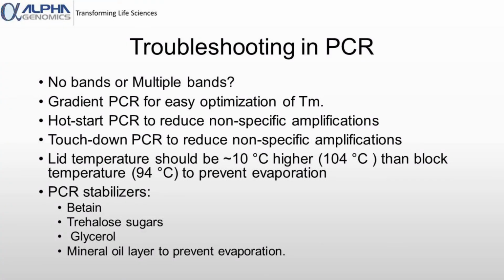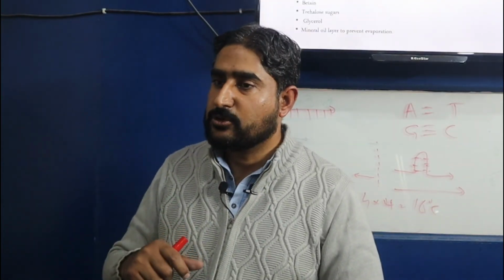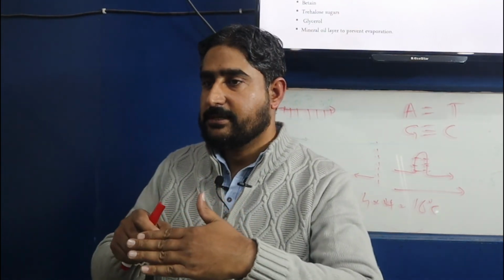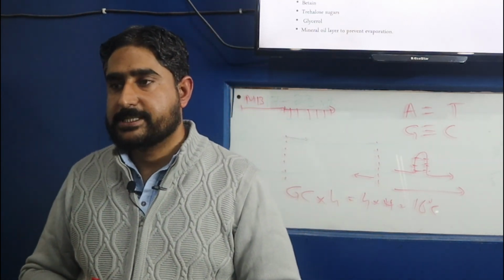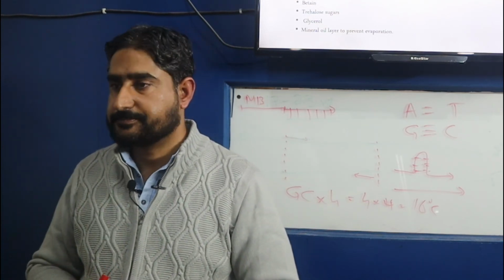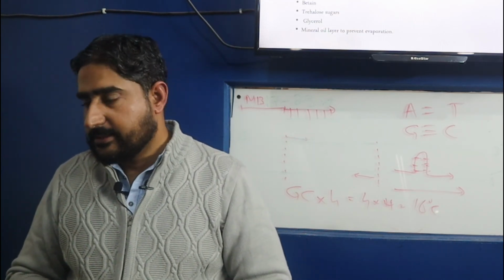The other thing is that sometimes in the reported literature, the sequences of the primers against certain genes are reported inaccurately. For example, you have been trying to amplify such a gene multiple times with no success, and when we checked that particular gene with the primers, we couldn't find any primer which could anneal to that template DNA. That means there has been some error in reporting the sequence for that gene. It might not belong to that particular species either.